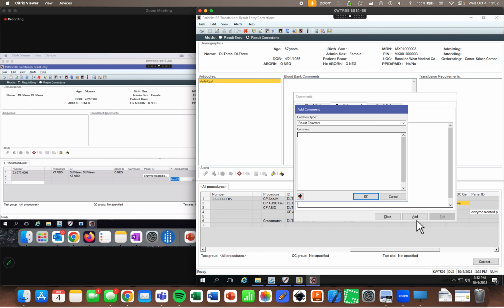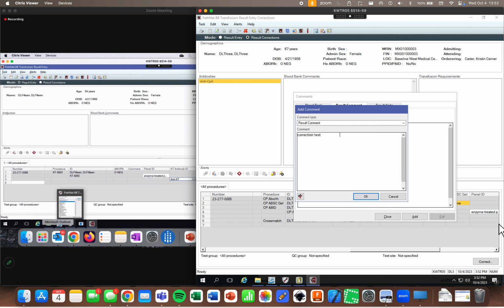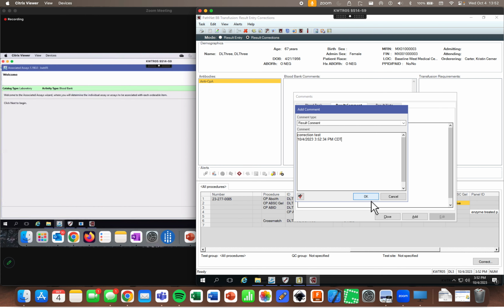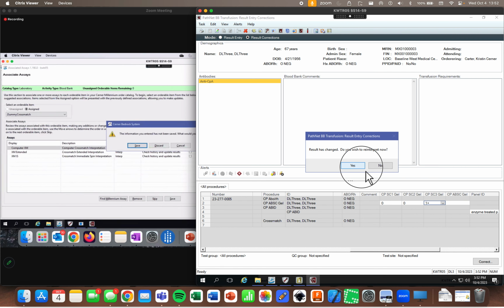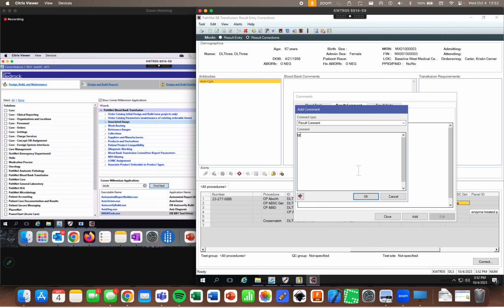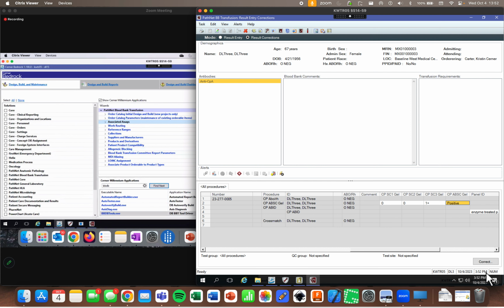Free text, which I don't even remember if free text is an option for Blood Bank. But free text is, I think, 25 characters. Yeah, okay, it is. So if you build something as free text, it's something like 25 characters. Text, I believe, is unlimited. Or if there is a limit, we're realistically never going to meet it.